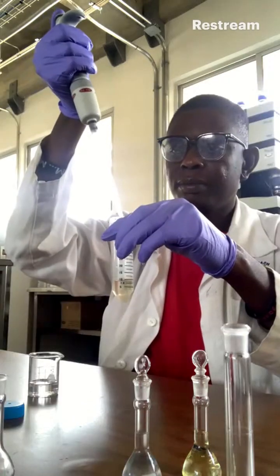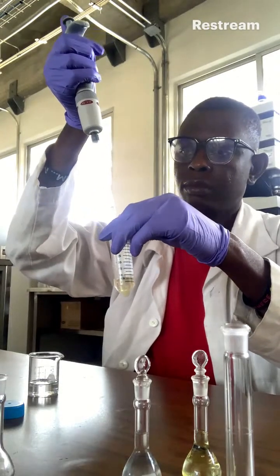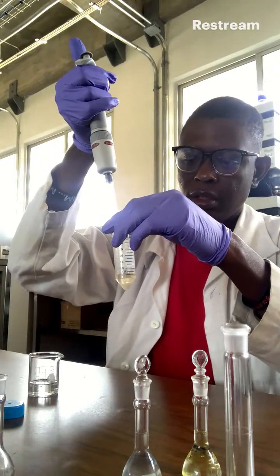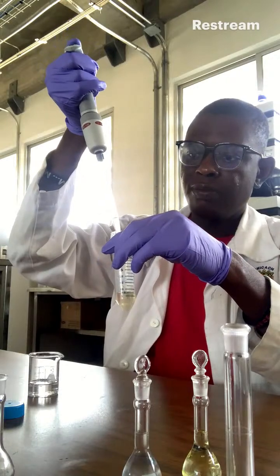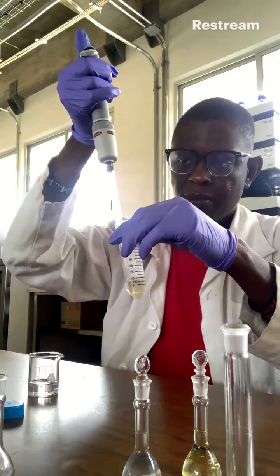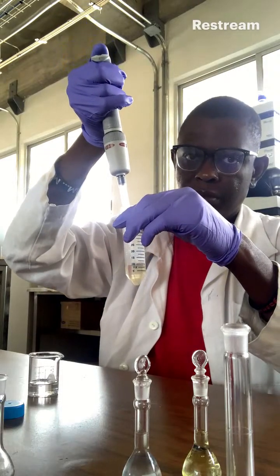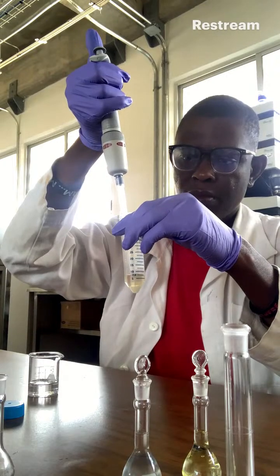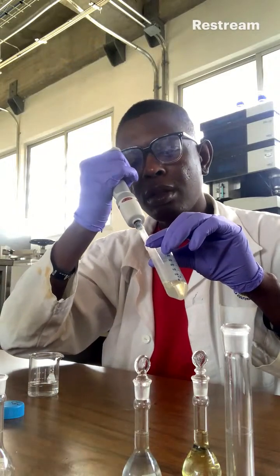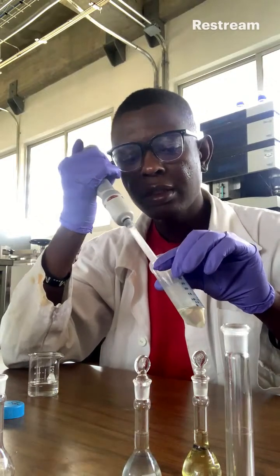I will dip in. Why is it not coming up? Is it too small? I can't pick. I'm having issues taking this.